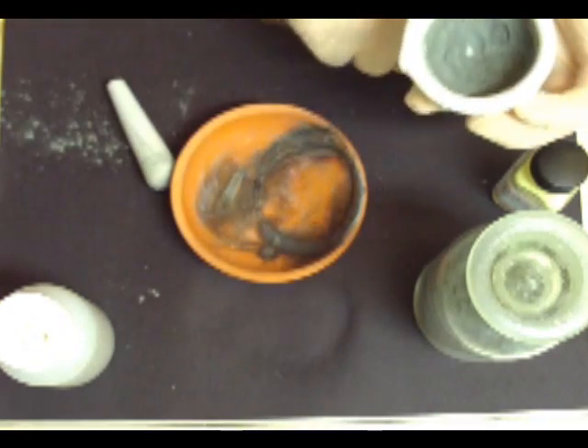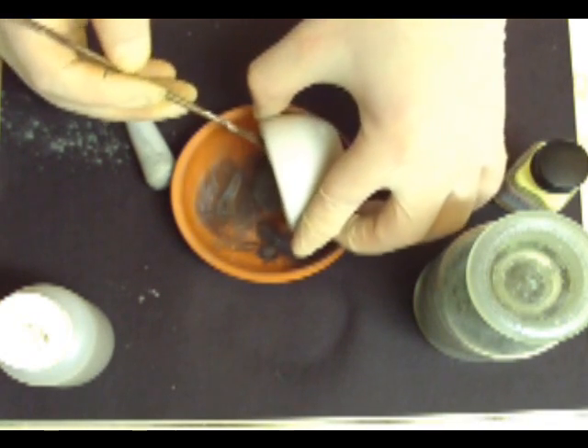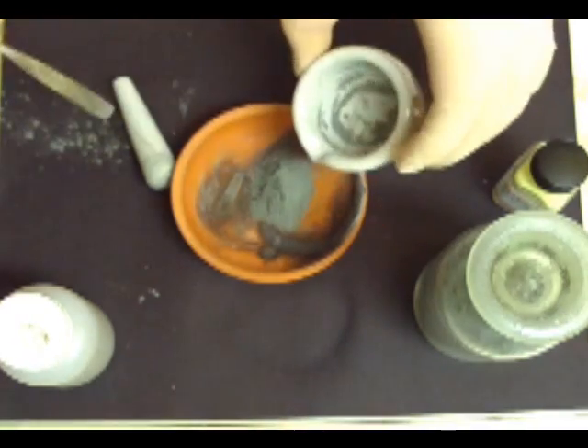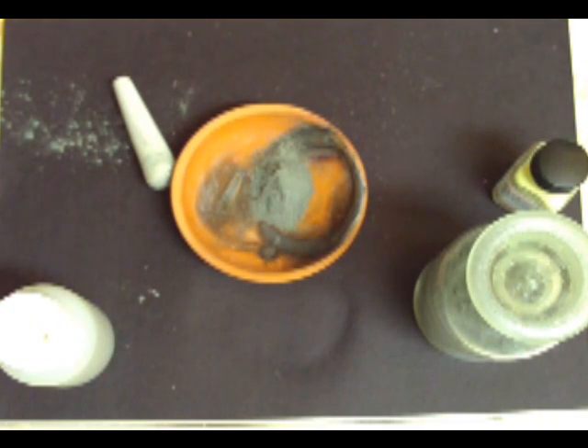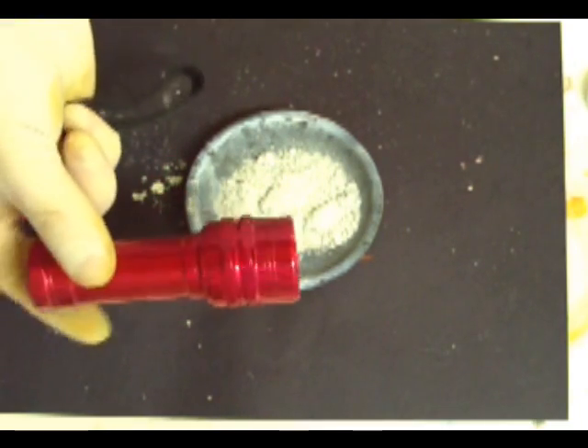Okay, so now we're going to add it to our heat-resistant plate. Try to get it all in one small pile — don't spread it out. Once you've got a small pile, grab your plate and head outside. In a safe place, lay this down and you're going to want to use a torch like this to set it off. And that worked out well. As you can see, it kind of splatters in places, so take precaution. And now you have your zinc sulfide glow-in-the-dark powder.